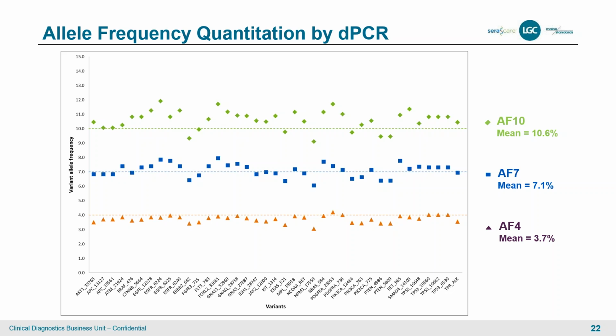The question is, what do you get out of NGS? It's obviously normal to expect some variability there, right? But you can independently assess that on a daily basis. So this would be the power of doing these types of control charts in your environment on a daily basis.